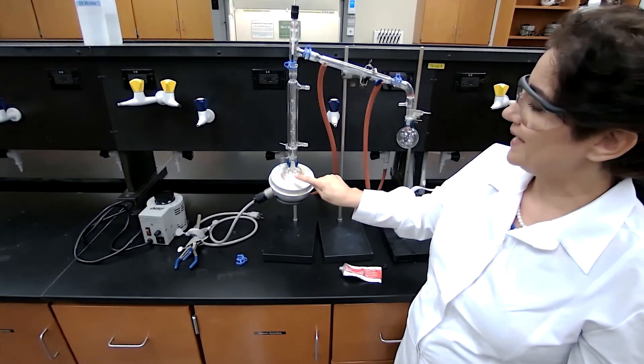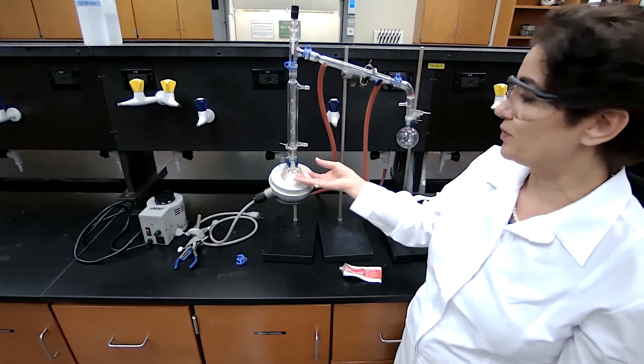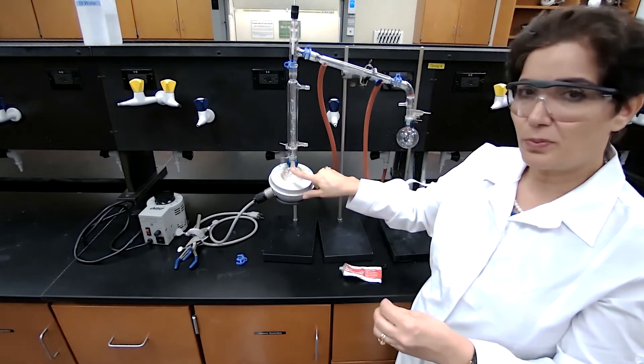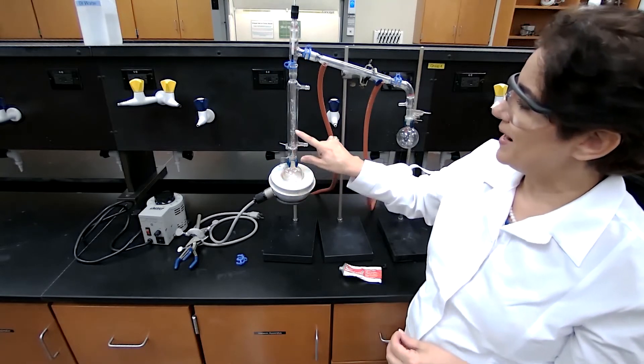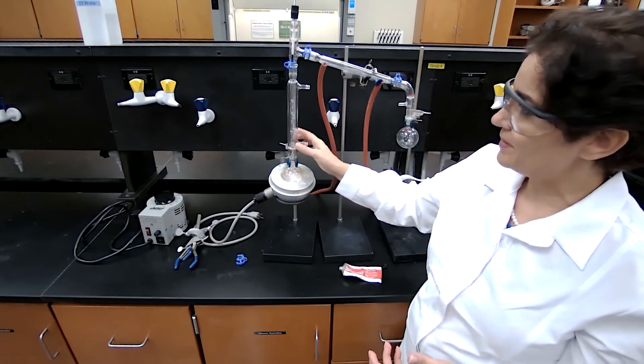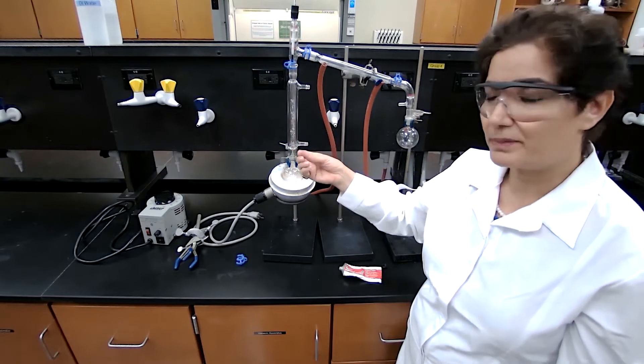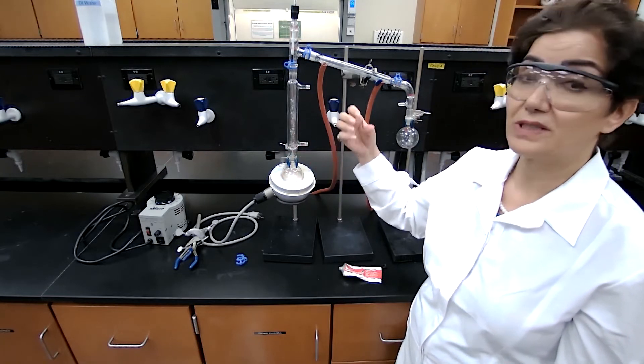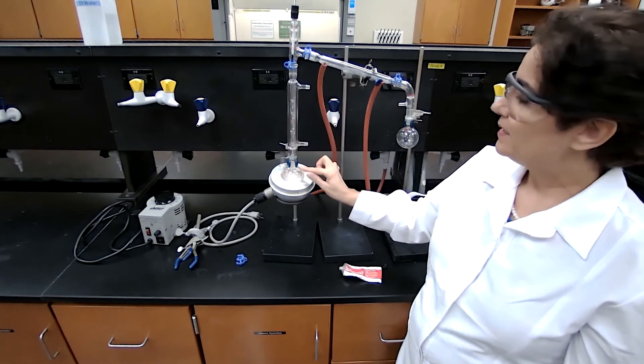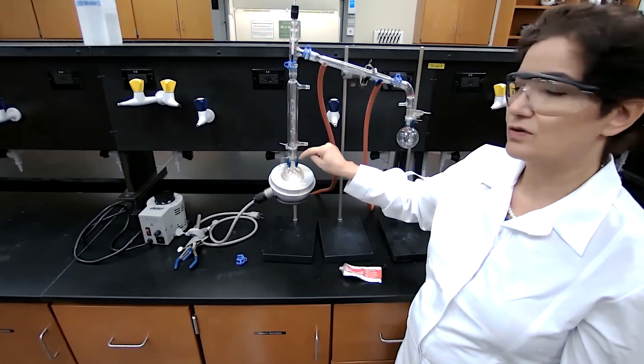Both vapor A and B are going to generate because they are close in boiling point. So when you heat up, both of them would go to vapor. Vapor A is coming from the compound with low boiling point - it's going to come up, condense, and go back at the beginning. At the same time, when condensation of the vapor takes place, because it's exothermic it would release some heat which means that the column is going to get warmed up. Compound B vapor also is coming up and it's going to condense and go lower.